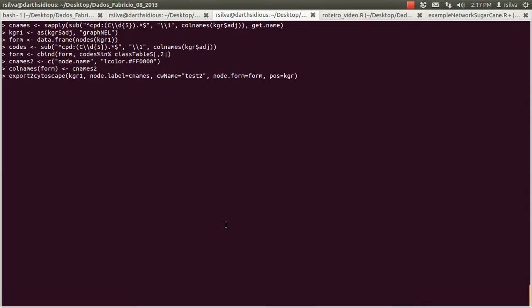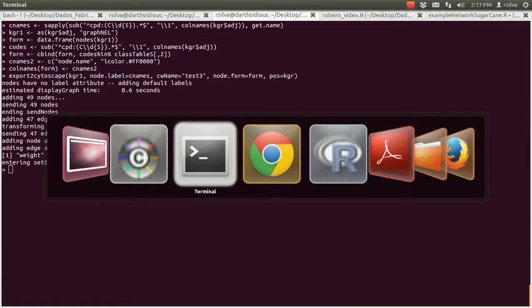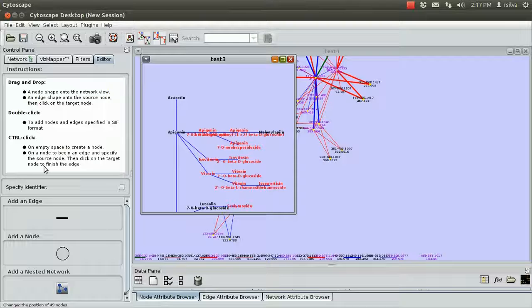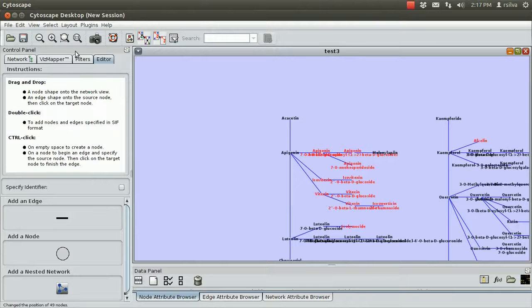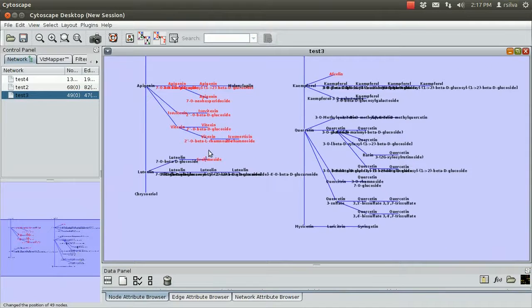Once we fix a target pathway, we can draw the KEGG pathway map through R to investigate the metabolite context. This is important because some metabolites may be absent for analytical limitations, such as extraction buffer exclusion, or lack of ionization. With this, it is also possible to dynamically search information, as well as to edit and save for later inference.